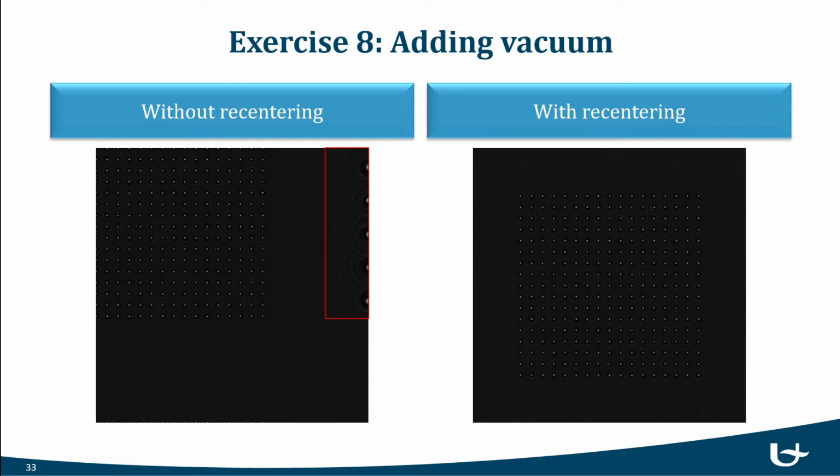An atom at the edge of the image wraps around the boundary if you don't compensate by adding vacuum around the nanocrystal. This wraparound effect still occurs in this figure, however, it only affects a region of vacuum now. Therefore, this effect does not introduce artifacts in our simulations.